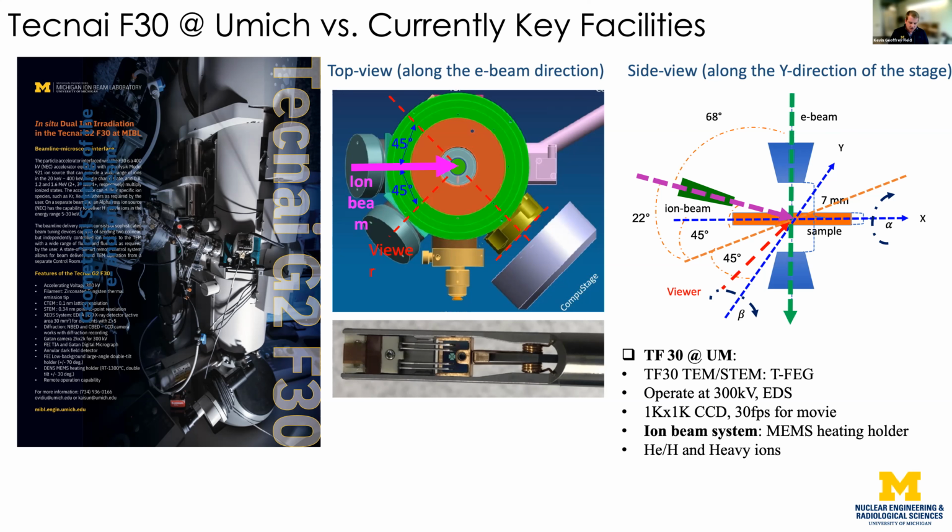And there's a whole bunch of science and engineering involved with trying to get those beams to come in right, having them be the right volume, considering the different angles, and also considering that just past this part over here, you have a bunch of turbo pumps and cryo pumps hanging off the ion beam, which causes vibrations. And so you have to consider vibration dampening in there. So there are a lot of complexities to commissioning a particular type of machine like this. Luckily, I wasn't here when they did that. My predecessor, Professor Gary Was, directed and developed those components. So I got to skip the hard part and I just get to use it now, which is an awesome place to be in.